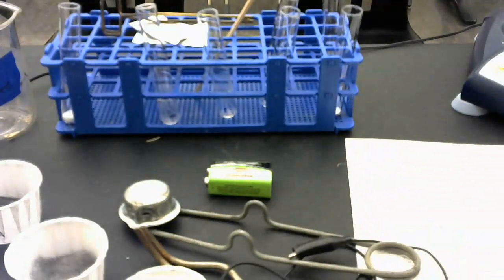So some pointers that I have included. Number 1, the purpose. The purpose of this experiment is for us to observe the 5 basic types of chemical reactions. That's the main purpose of this experiment. So as you're going through the lab, what you should be doing is reading the instructions on the lab table and answering your questions in your Chromebook as you go along with the lab.